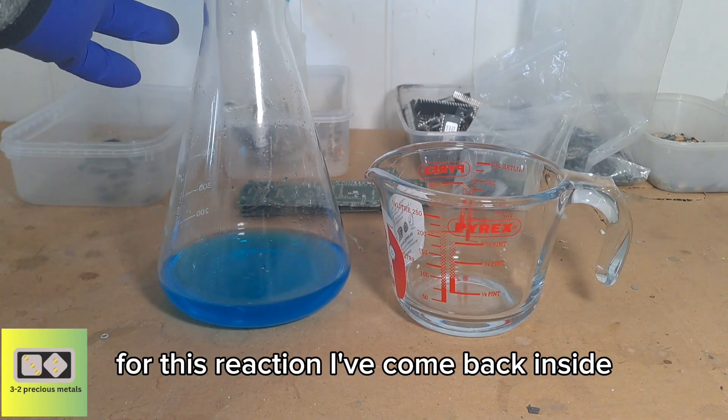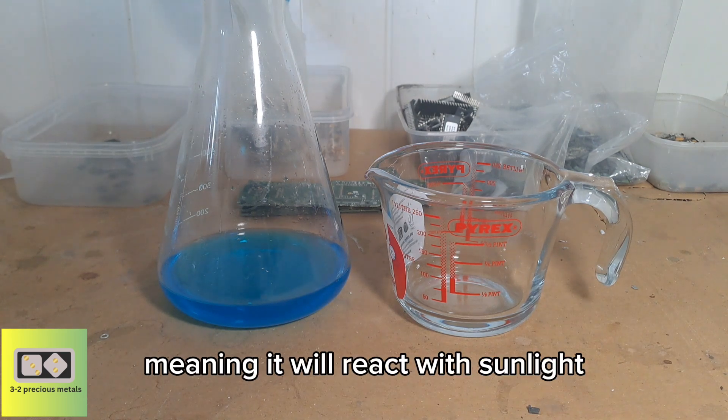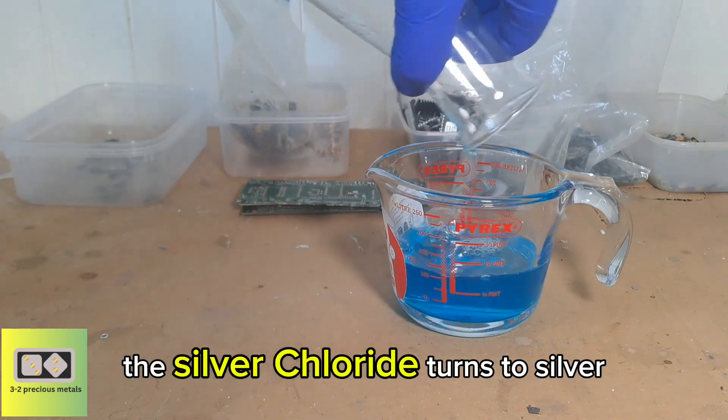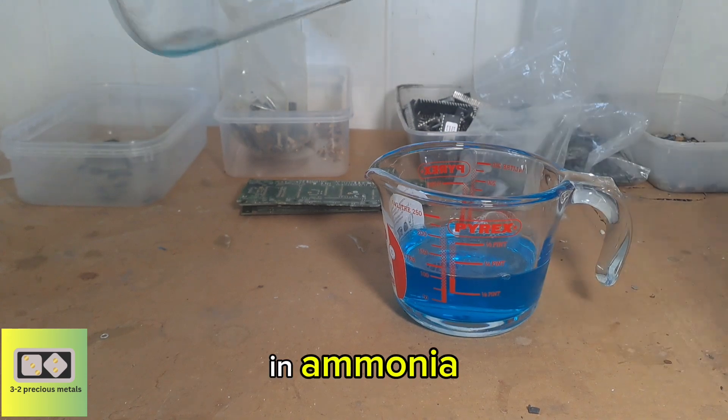For this reaction I've come back inside. Silver chloride is photosensitive, meaning it will react with sunlight, and what I don't want to happen is the silver chloride turning to silver before I have a chance to dissolve it in ammonia.